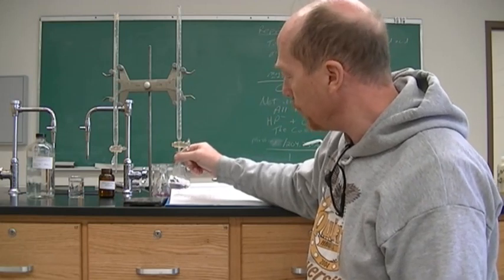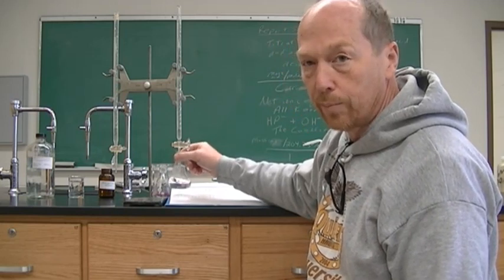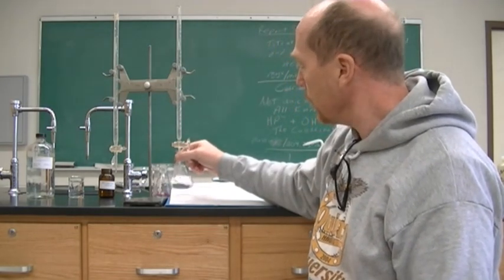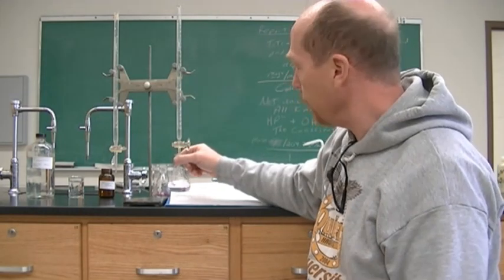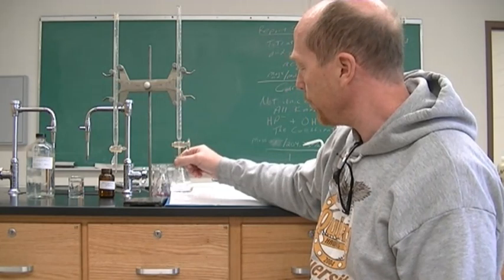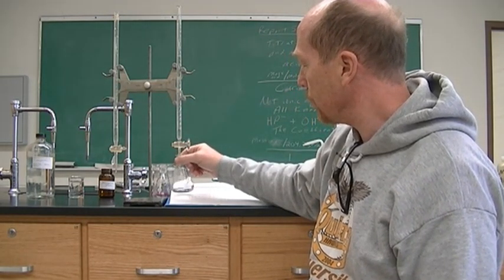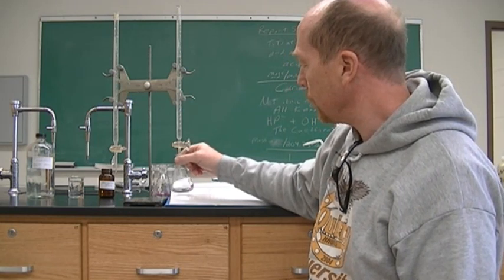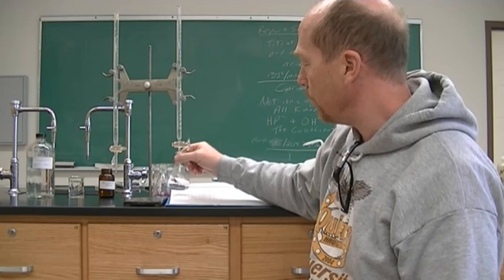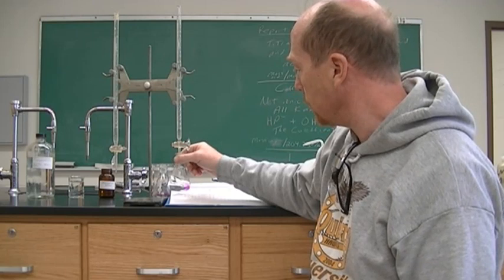And you swirl it as it's going in. You could do the two-hand approach. If I do the two-hand approach, no one could see what's going on in our titration. So one hand getting ready to turn off the stopcock while the other hand will swirl the flask. The color is starting to linger a little longer. We're getting closer.